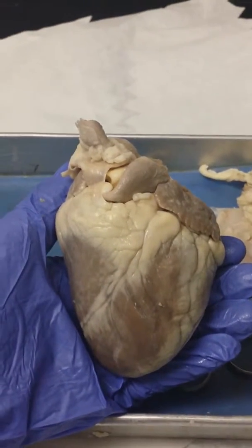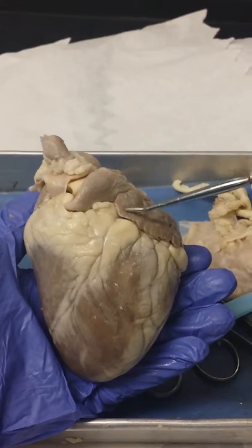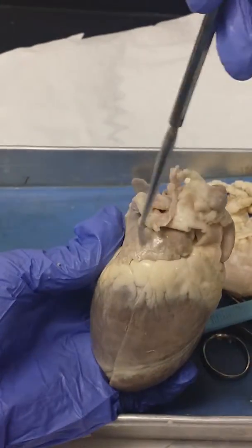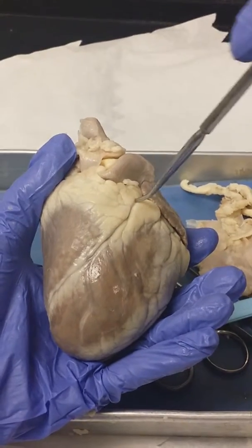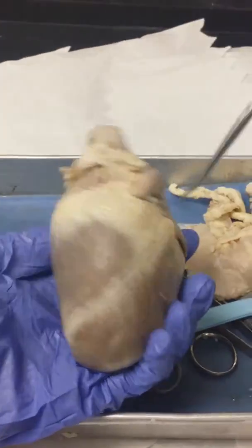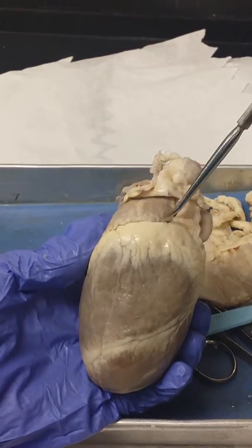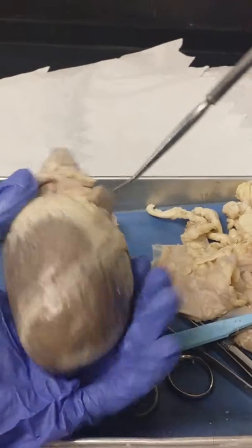This is the sheep's heart, and this is the anterior side of it. This is your left auricle, and then this is your right auricle. Right here is your anterior interventricular sulcus, and right by your right auricle, this is your coronary sulcus.